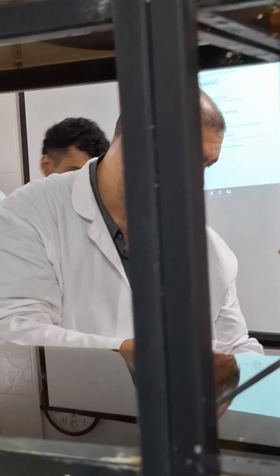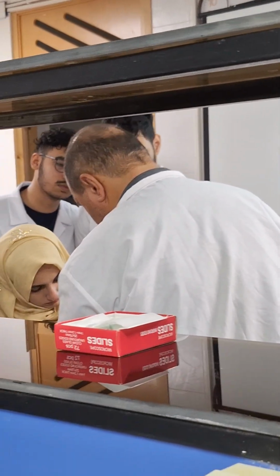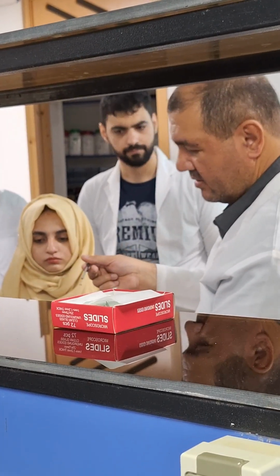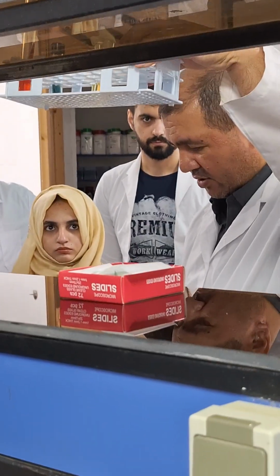Do zigzag. Yes. Like this. You understand? Yes. That's right. And place it on the rack. This is a rack for tubes.